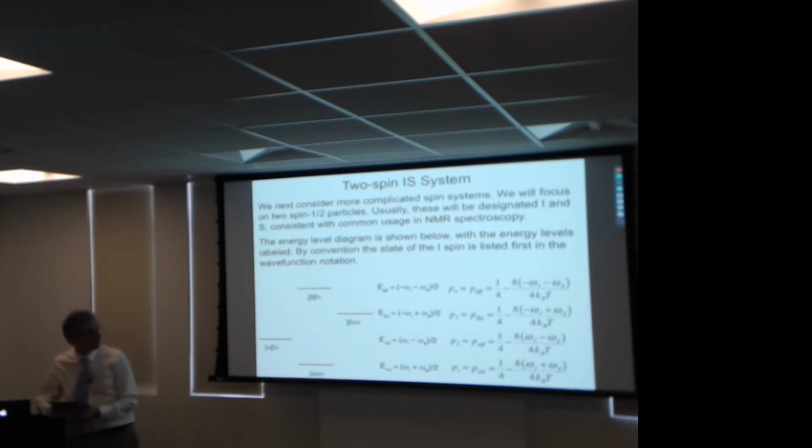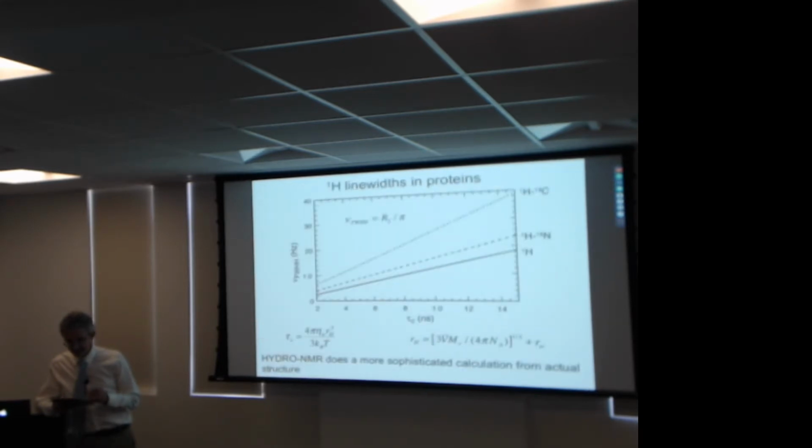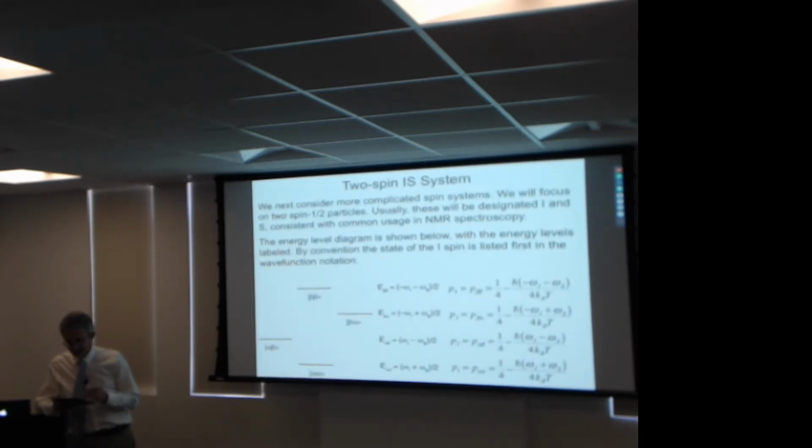So we'll usually call the two spins I and S. Our usual convention will be that in these kinds of notations, the I spin will be listed first.